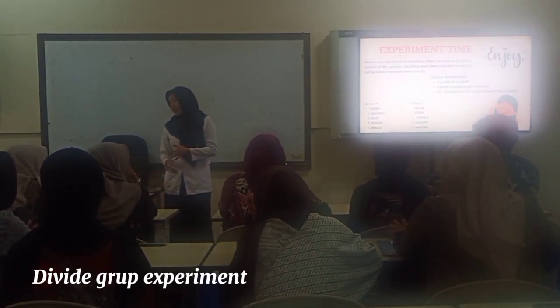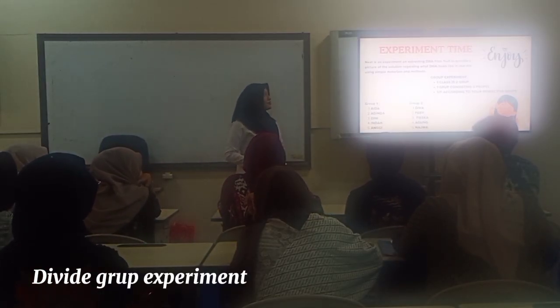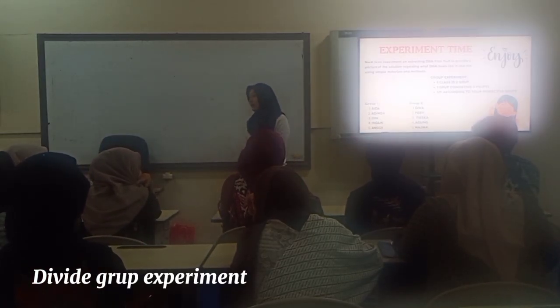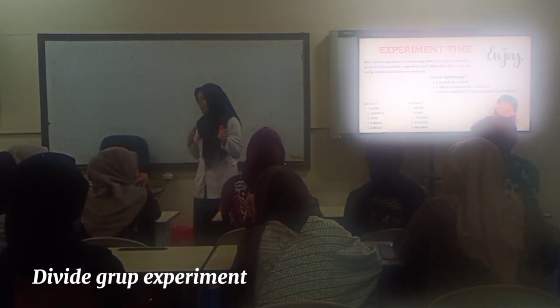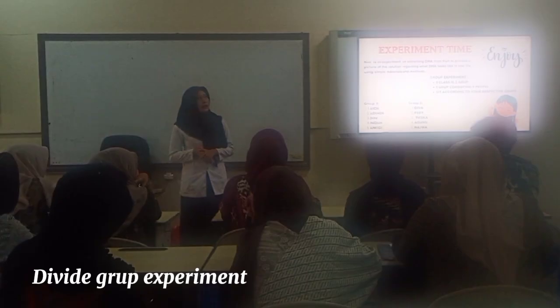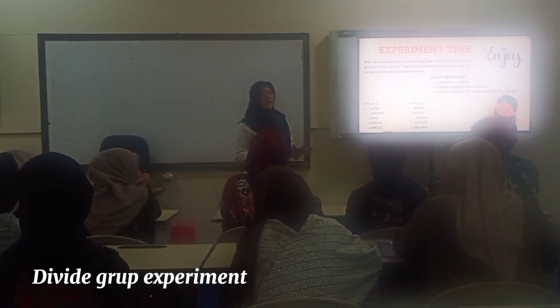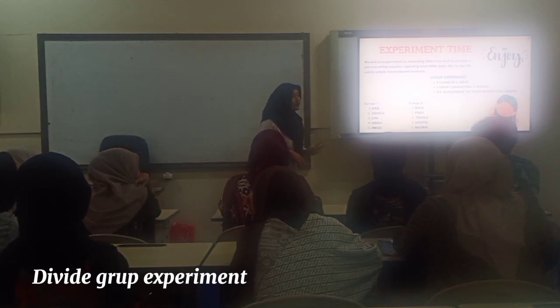Okay. Next we continue to the experiment time. Next is the experiment on extracting DNA from fruit to provide a picture of what DNA looks like in real life using simple materials and methods.